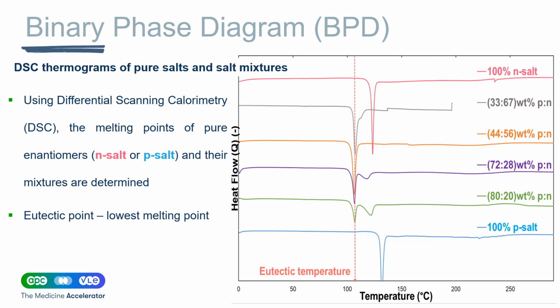Onset of the first melting peak represents the temperature at which melting begins, often linked to the eutectic transition. Peak or end of the second melting peak indicates the final melting phase corresponding to the more stable diastereomeric salt. These thermal properties help us understand the solid-state interactions and determine the feasibility of selective crystallization for resolving ketoprofen.